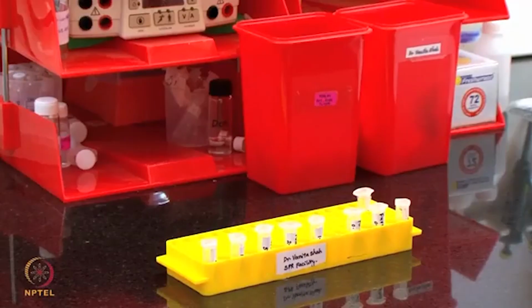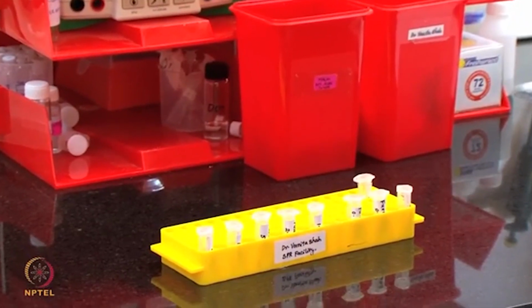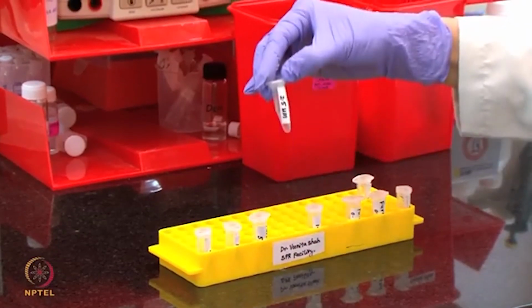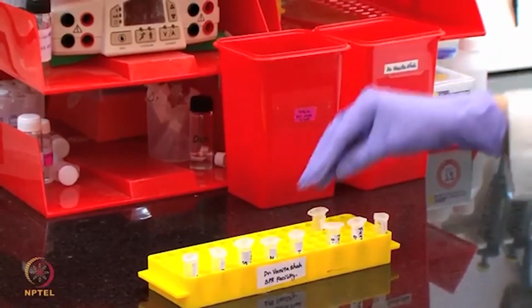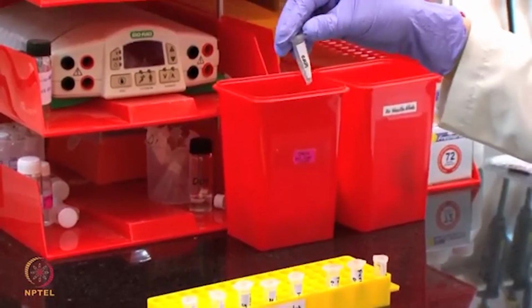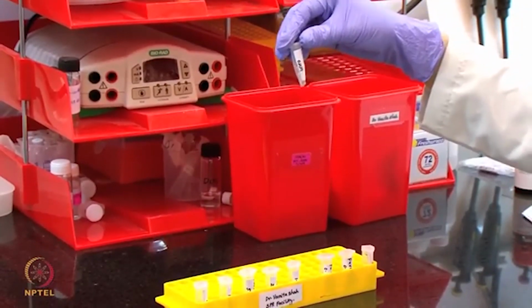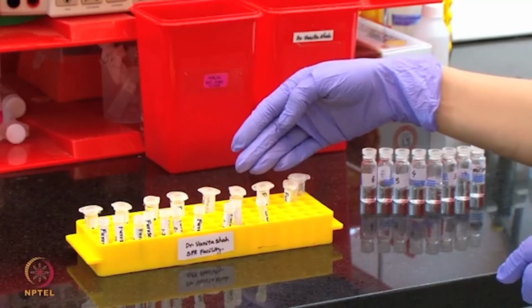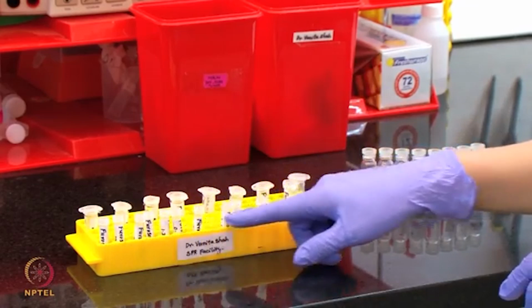One of the concentrations should be run in duplicate. So here in this experiment, we will be running 2.5 micromolar concentration in duplicate, and we will also include 3 zero concentrations, which will be nothing but the running buffer. All of these samples and reagents have now been aliquoted in the required volumes in these specialized tubes.